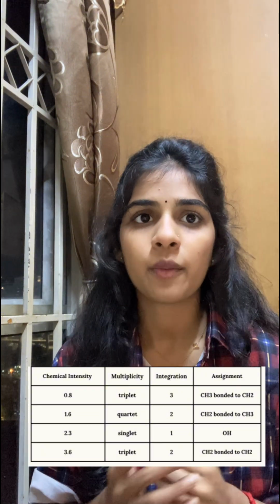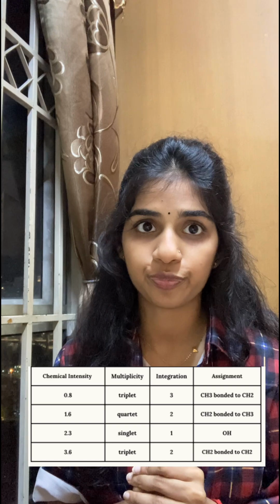Moreover, the signal at 1.6 ppm, a slightly higher chemical shift, points to a CH2 group adjacent to a CH3 group. The quartet splitting shows it's coupled with 3 neighboring CH3 protons. Integration of 2 confirms 2 equivalent protons.